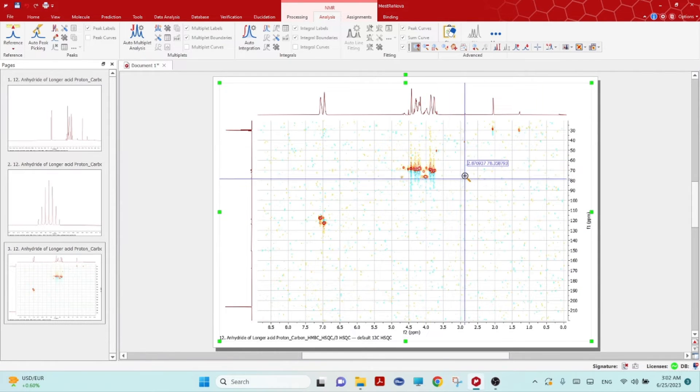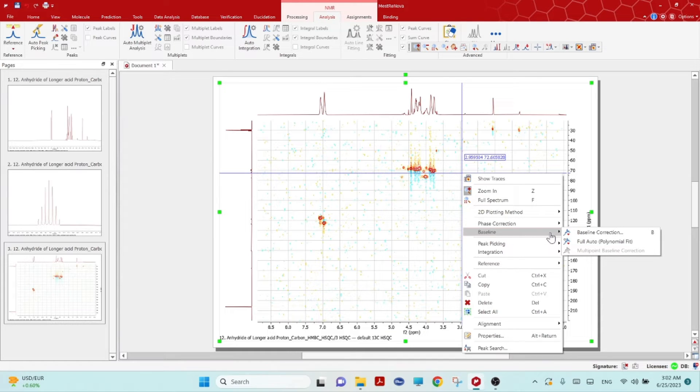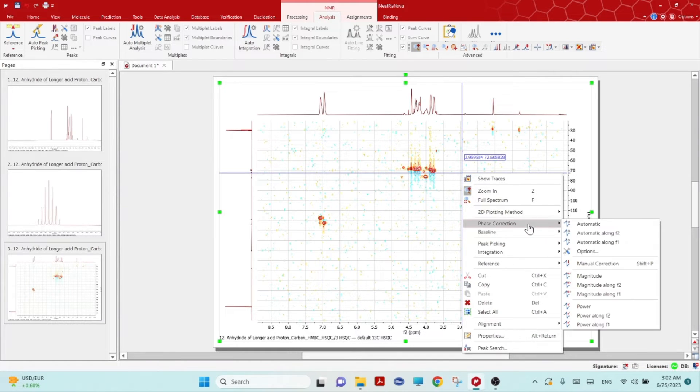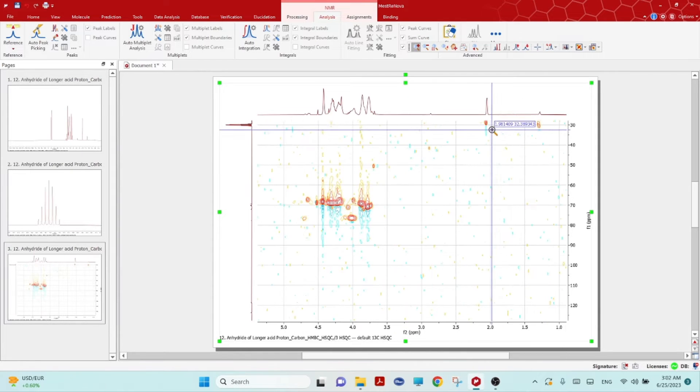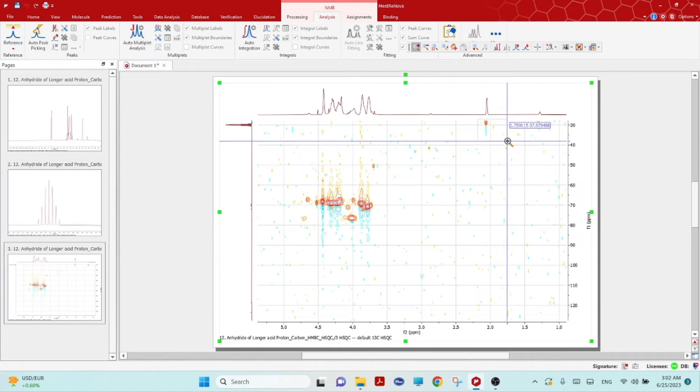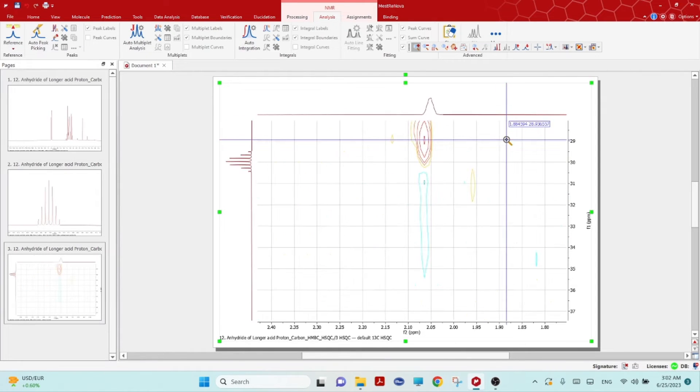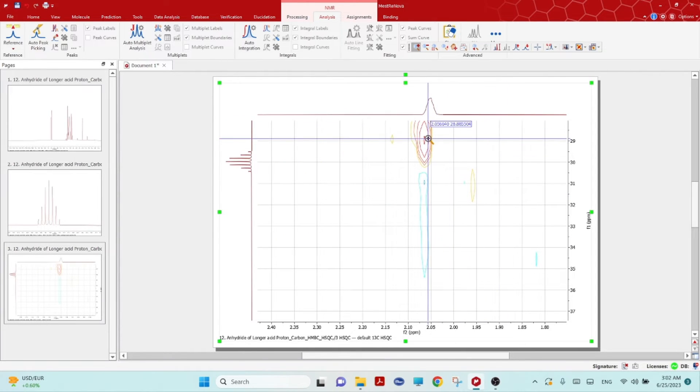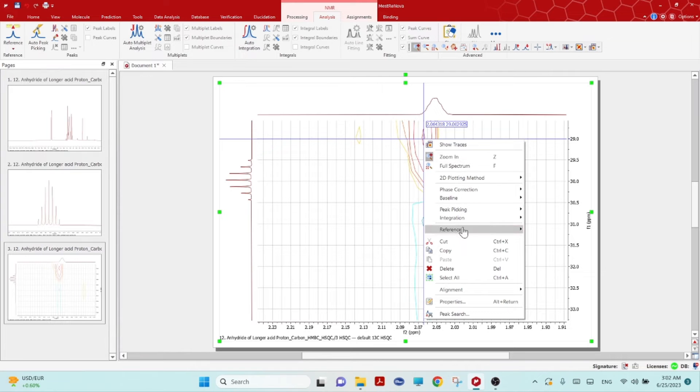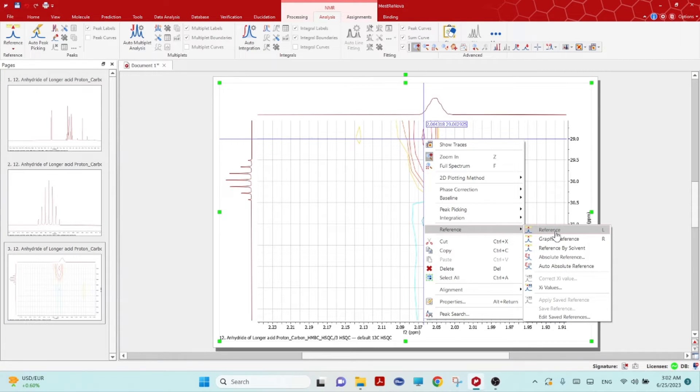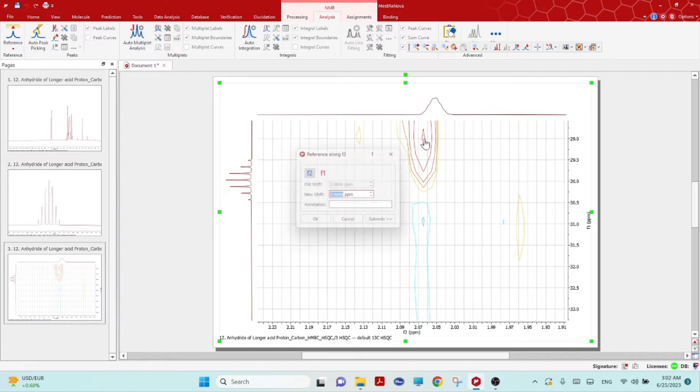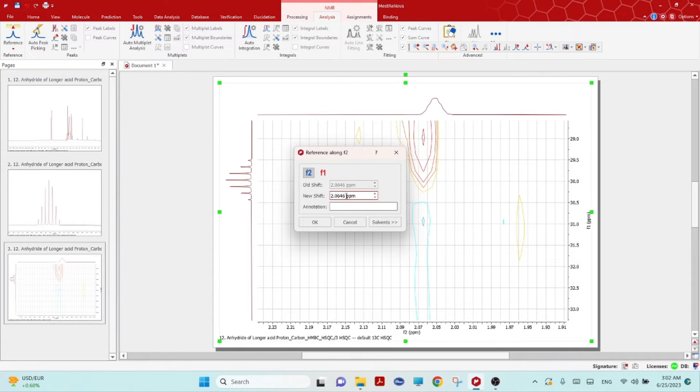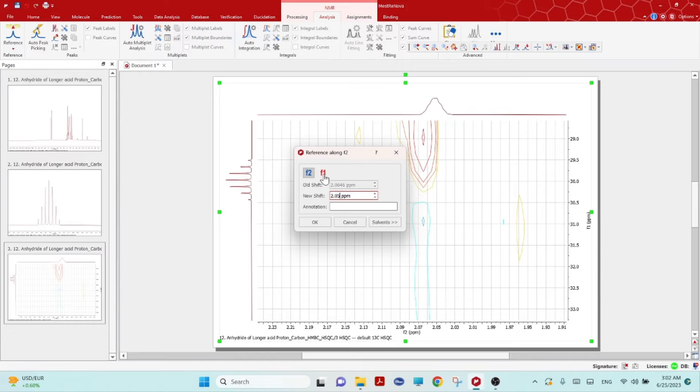If you zoom this area, right mouse click reference, then click on the center with left click. Here you can put 2.05 while it is F2, the proton dimension.